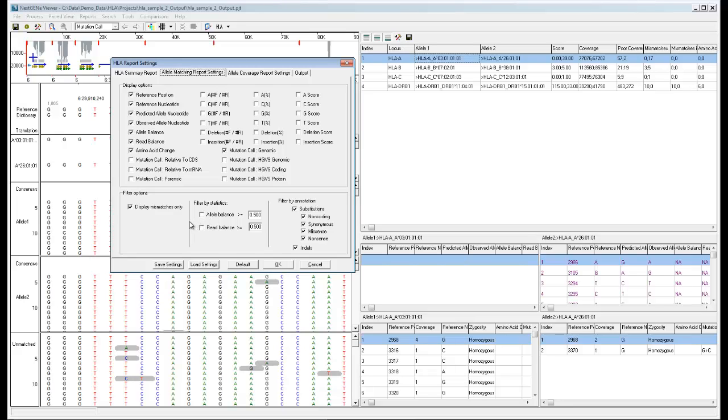You can also filter mismatches based on statistics, the allele balance and overall read balance, or based on annotation to include or exclude mismatches of each type.